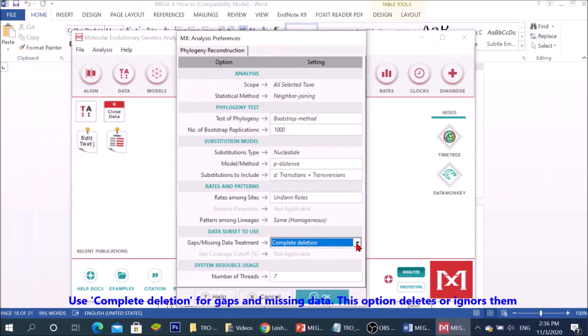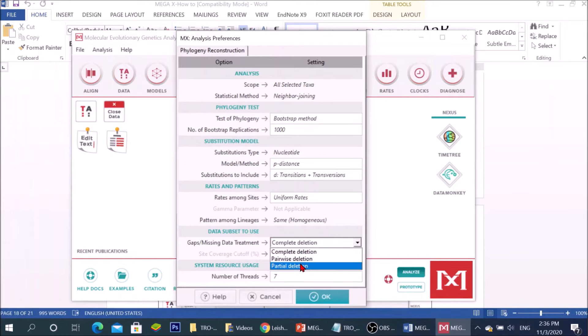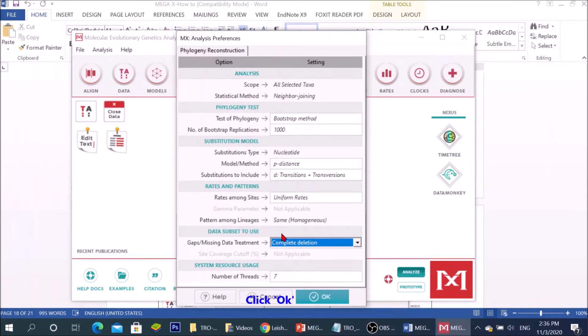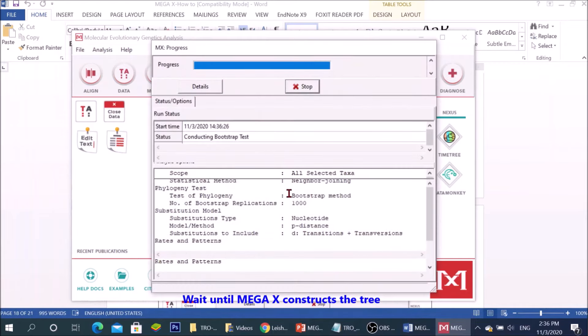This option deletes or ignores them. Click OK. Wait until MEGA constructs the tree.